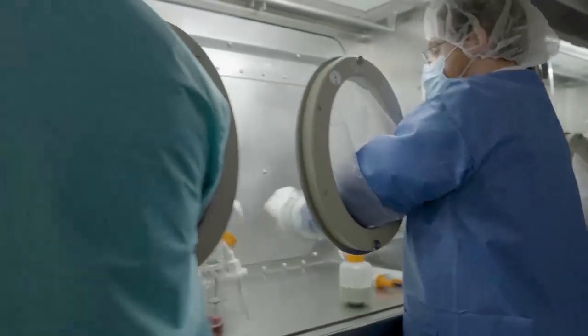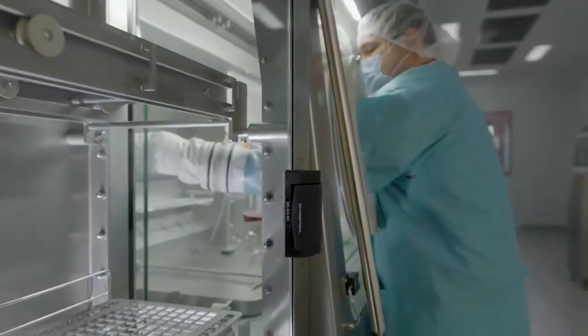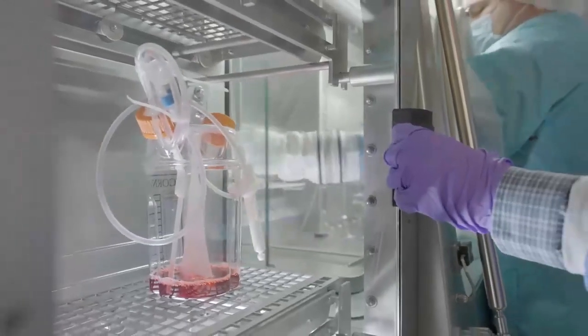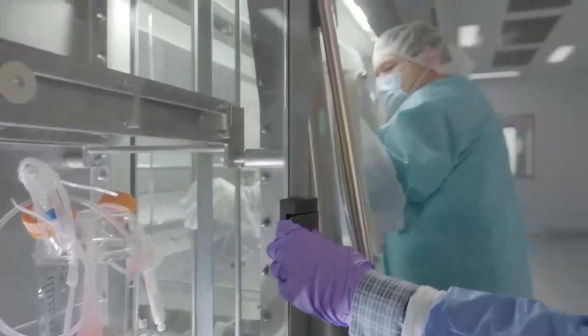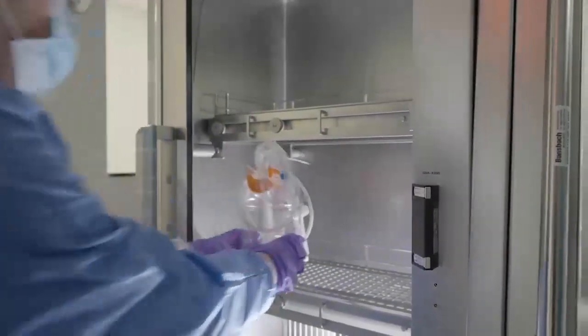So the security of our cells is critical. Throughout the process, we make sure that we have chain of identity managed, as well as manufacturing inside the isolators to ensure that we have produced the most safe and pure product for our patients. To build a true GMP manufacturing facility, you have to be exacting and specific about everything. There should be no activity that you do in a GMP space that doesn't have a process underlying it.